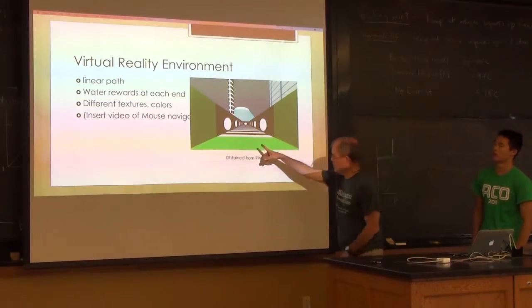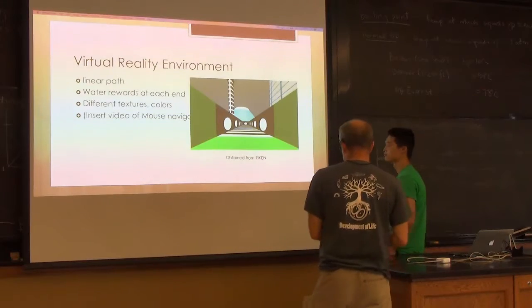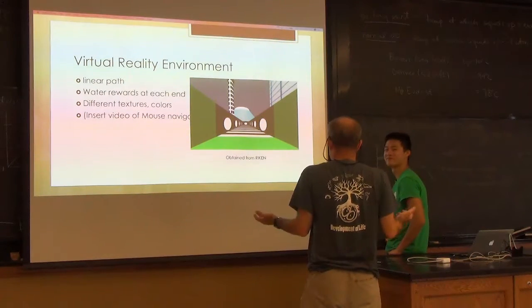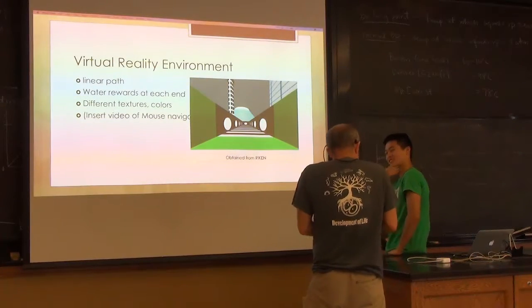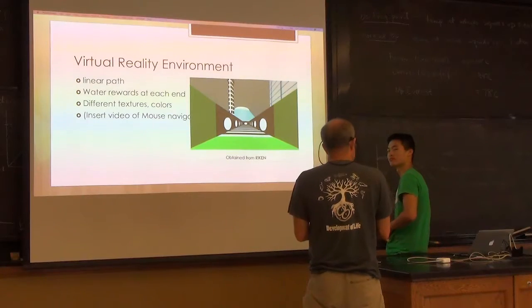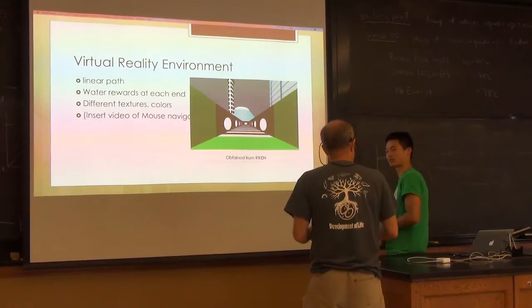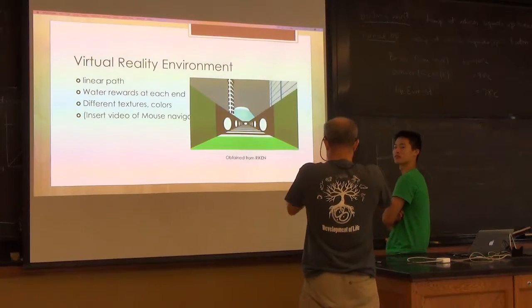I like this part, because that actually helped me. And also when you're talking about the VR, because you said they run, I'm like, well, how do they run? You have them in the head plate. Right, so in the VR, just to say, it's not a wheel, but it's essentially a wheel, so they can run. Yeah, they can run. It sounded to me like it was this thing that was levitating and they run.